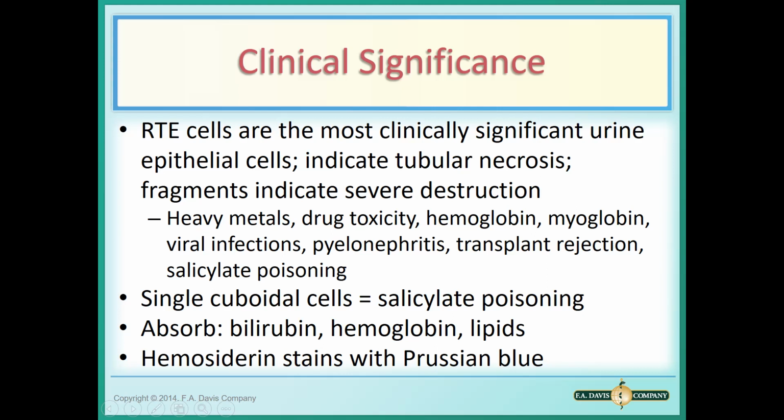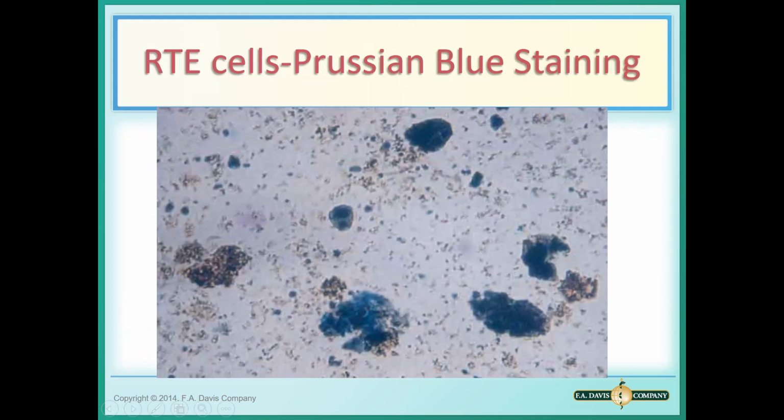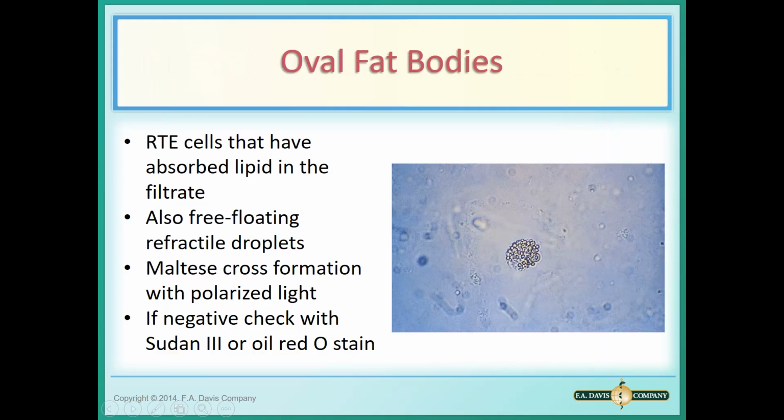And that stain we talked about last time was a hemosiderin or heme, iron from heme. And we talked about the Prussian blue reaction. It's always for iron. So we can sometimes see here, these are renal tubular cells that have taken up hemoglobin. And when we did a Prussian blue stain, they turned blue. You can actually see individual iron deposits within the cells as well. So sometimes you see overall, but sometimes you see very distinct iron deposits within it. Other stuff stained as well.